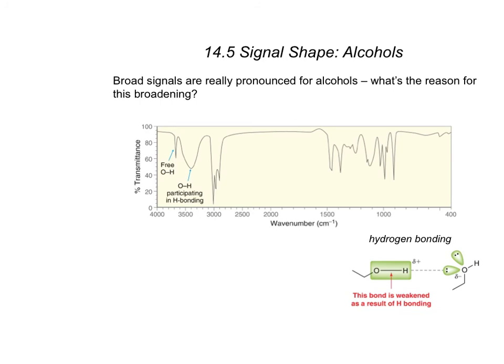Let's say we're looking at the IR spectrum for ethanol. If we look at this molecule, and we're looking specifically in the diagnostic region, so we're cutting this off at about 1,500 and only looking to the left of this, what would we expect to find? We already know this is the molecule, this is the IR spectrum for it. What should we actually be looking for in the diagnostic region that's present in this molecule? Is there a dipole moment to a huge peak over 1,700?